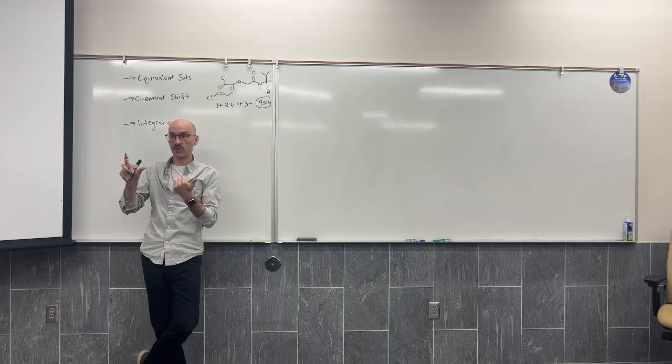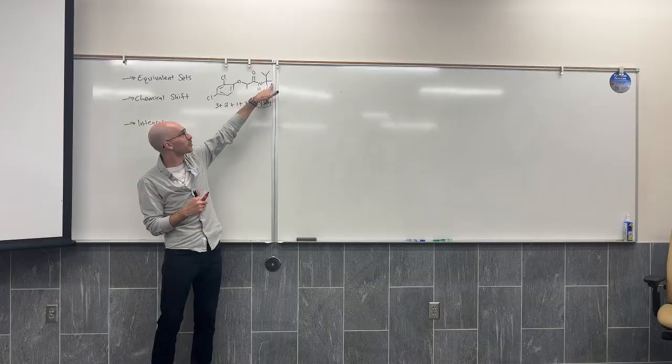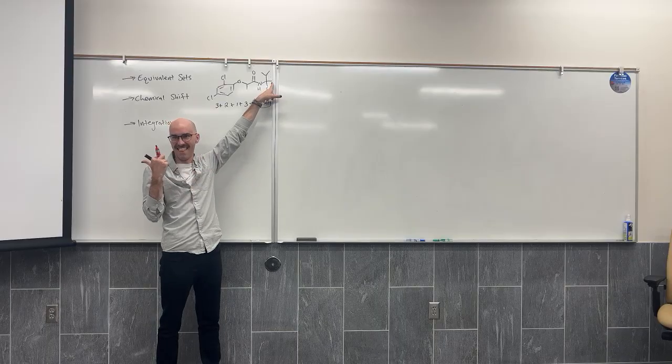To the left. Is that your left? That's your right. Sorry. By being closer to the nitrile and the amide, this methyl group shifts more to the left.